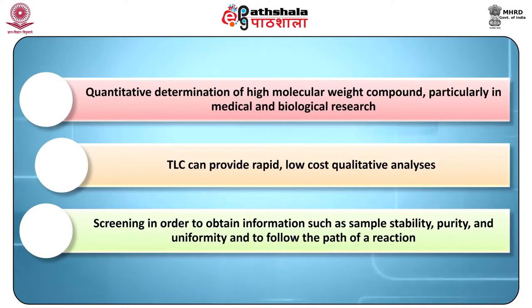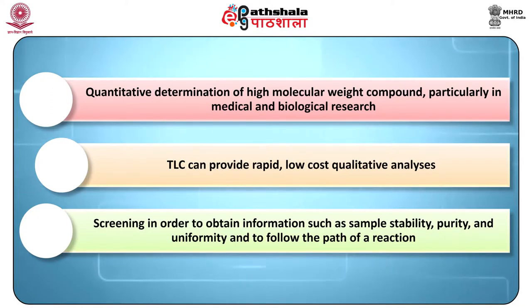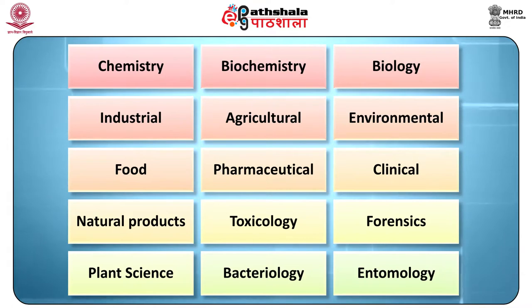Applications of TLC. Quantitative determination of high molecular weight compounds, particularly in medical and biological research. TLC can provide rapid, low-cost qualitative analysis and screening in order to obtain information such as sample stability, purity and uniformity, and to follow the path of a reaction. TLC has been applied virtually in all areas of analysis, including chemistry, biochemistry, biology, industrial, agricultural, environmental, food, pharmaceutical, clinical, natural products, toxicology, forensic, plant science, bacteriology, and entomology.